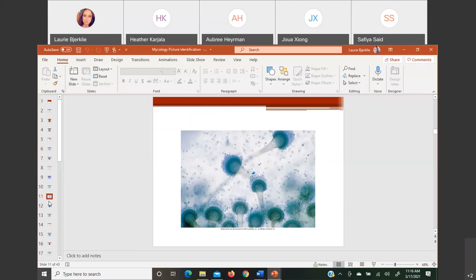Aspergillus, in this case, this would be fumigatus, which is like farmer's lung, they call it. Again, it's just opportunistic. Oh, you got to see one of these. Oh, you did too. Nice. Did you guys recognize it right away? Yay. Good. It's even better when you know it. Good. Perfect. Oh, I'm so glad.